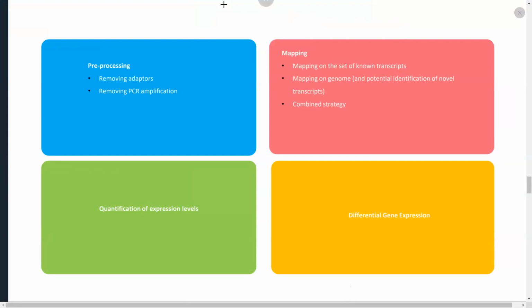So the transcriptomics section was already covered in a few classes back, where we had talked about the RNA-seq pipeline, which is one of the most basic pipelines available on a server platform. Here are the four major areas or sections of which an RNA-seq pipeline is built.